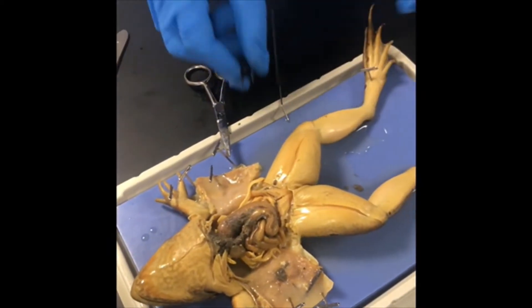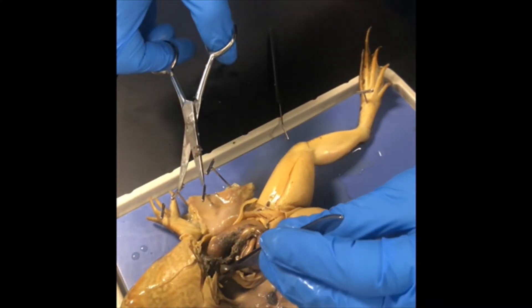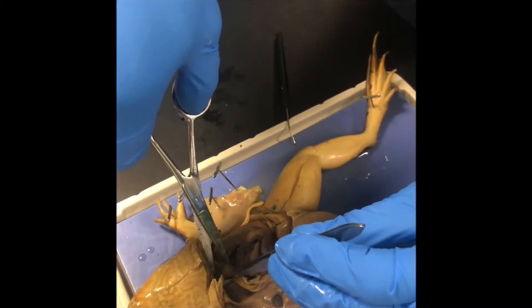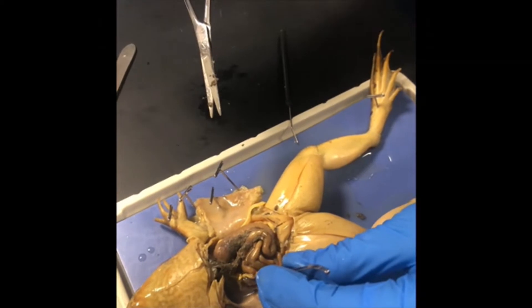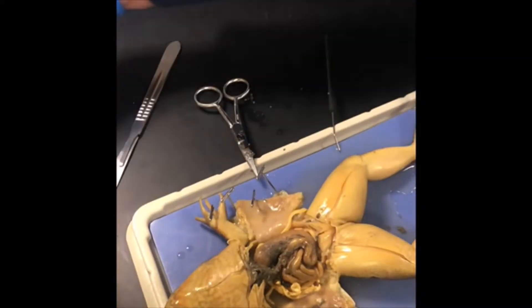Under the liver, find the gallbladder. Make sure you cut the base of it so as not to release the liquid that's inside. I released the liquid that was inside — it went all over.